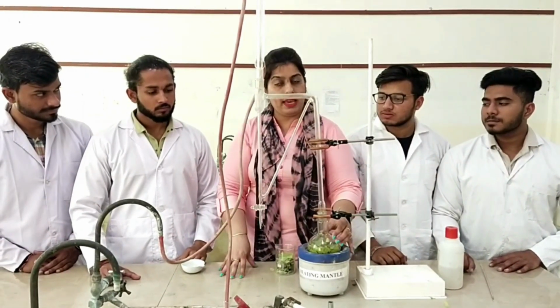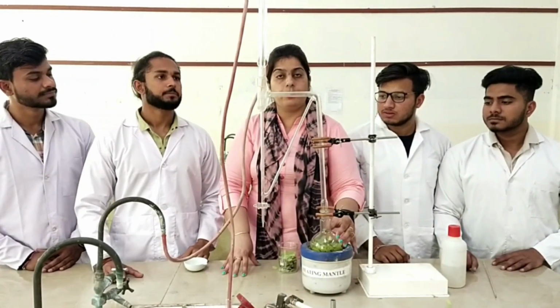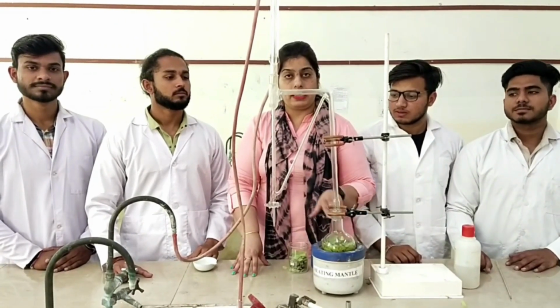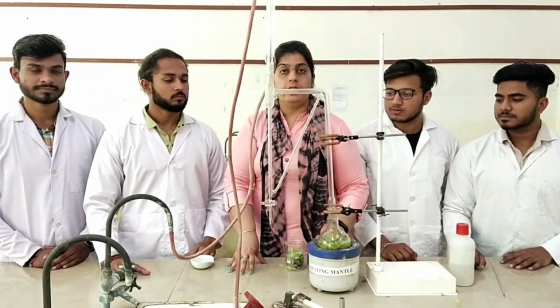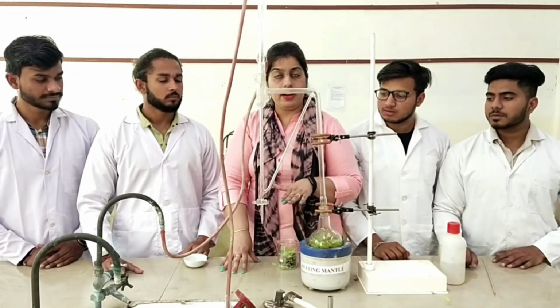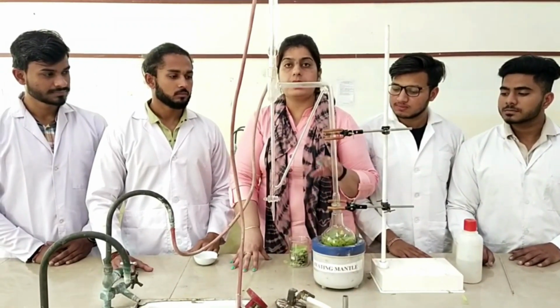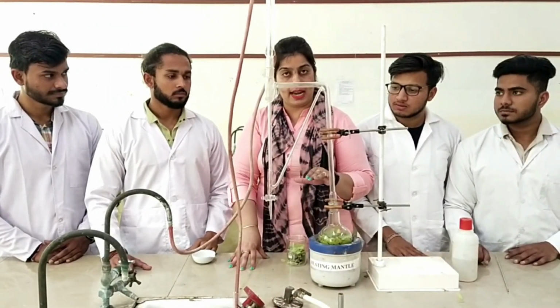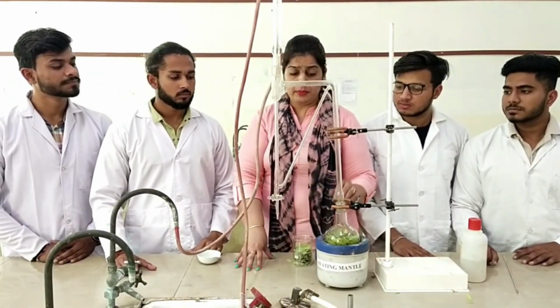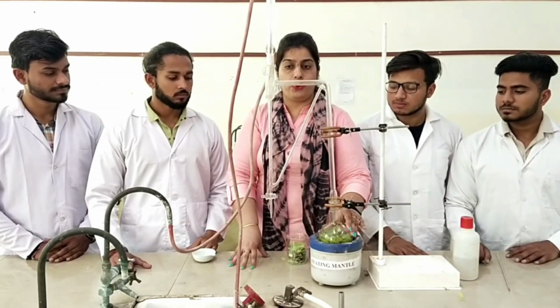But in some cases, like clove or cinnamon, the volatile oils of these drugs are denser and will be at the bottom of the water. The density will be more, so it is heavier and will be at the lower level. In eucalyptus, the oil is less dense, it is lighter, so it will be on the upper side of the water. This takes 3 to 4 hours for the isolation of oil.